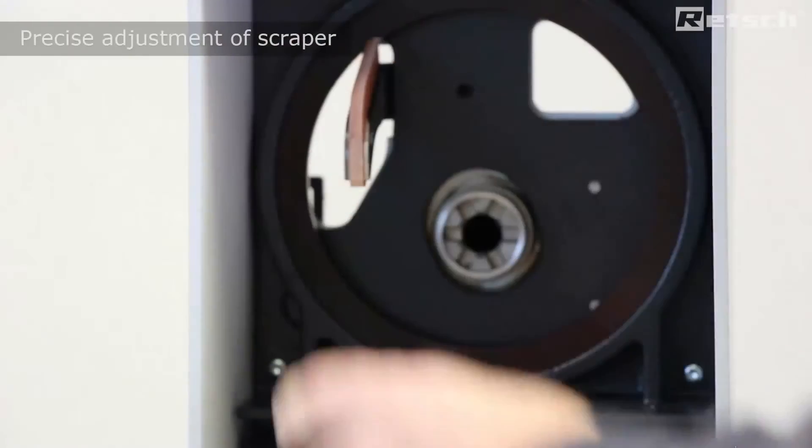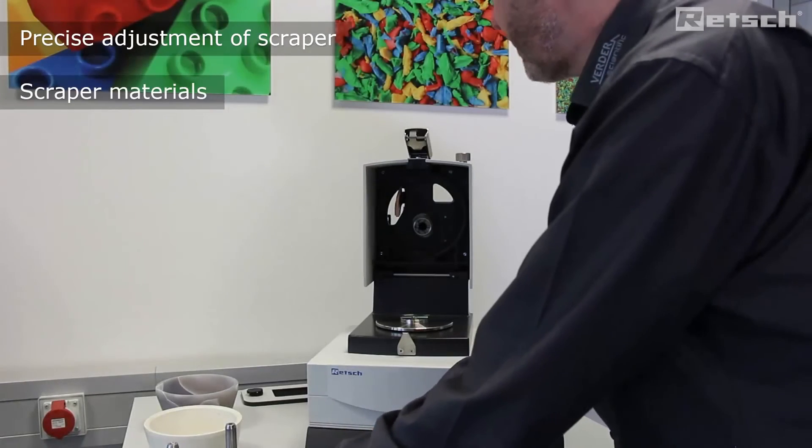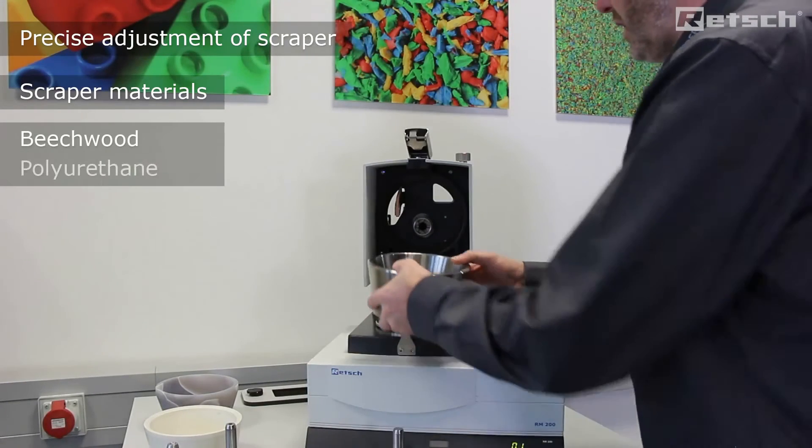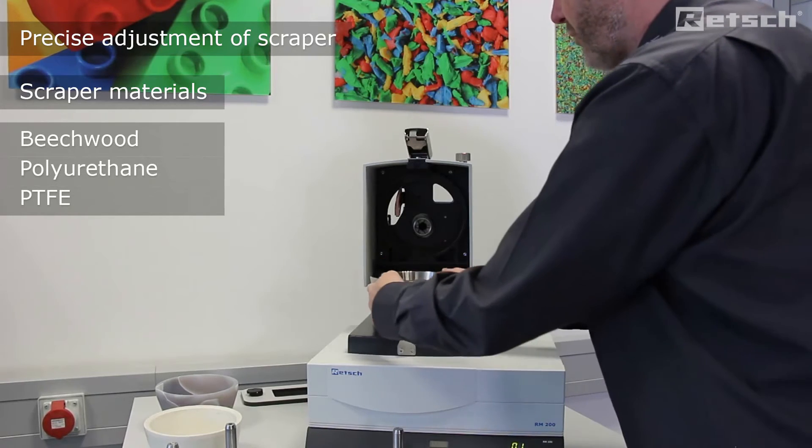We can also adjust the scraper. Scrapers are available in three different materials, including PTFE to accommodate cryogenic preparations.